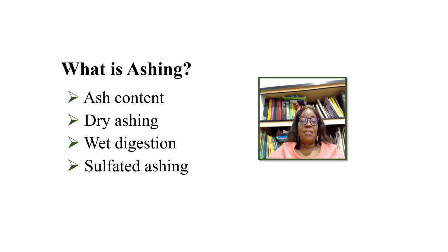What is ashing? Ashing is that process whereby a sample is burned in a muffle furnace or treated with acids to get the mineral composition of that sample. An ashing technique is very important in analytical chemistry.